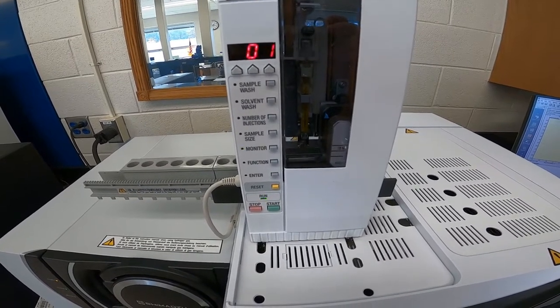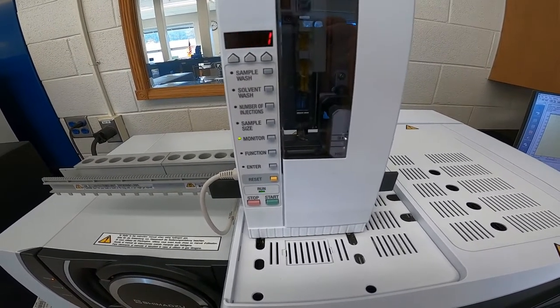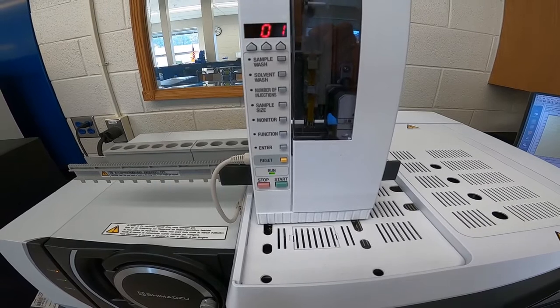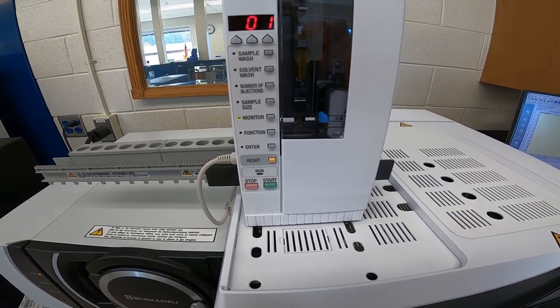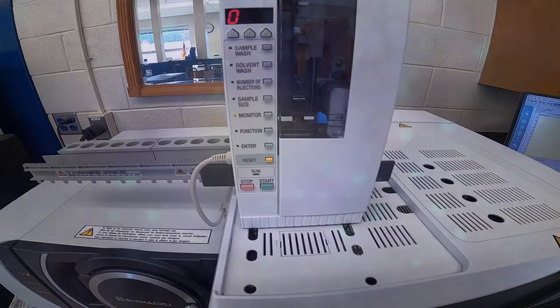That goes into the gas chromatograph for the separation, and then as compounds come off the gas chromatograph into the mass spectrometer, they'll be analyzed for both qualitative and quantitative amounts. And that takes probably about 7 minutes for the run to show our product, so I'll come back when the data is finished running.